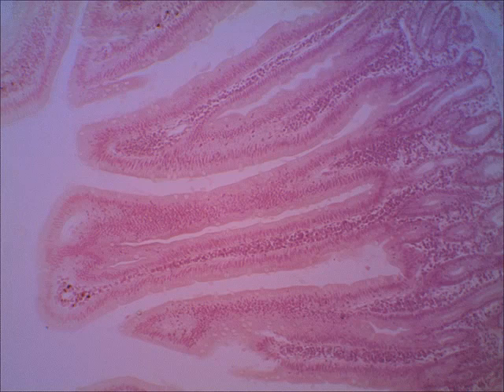So here's another view on the high power. Again, here you should be able to recognize, like right here, you can easily see that simple columnar epithelium. You see it there. It's got to be sectioned just right to see it perfectly. The little bubbles that you see within it, that just represents the goblet cells, like there, there. Remember, goblet cells produce mucus.